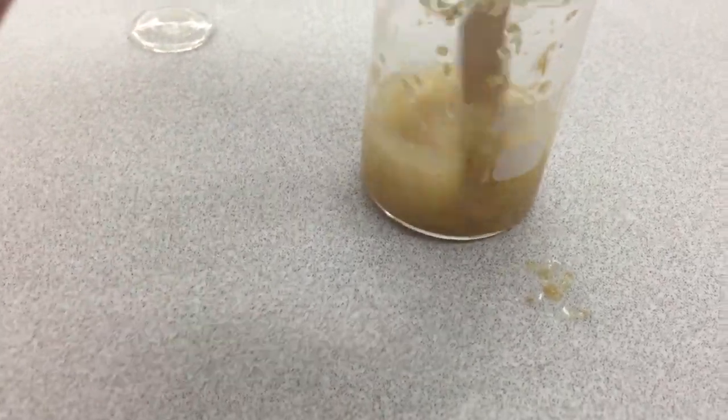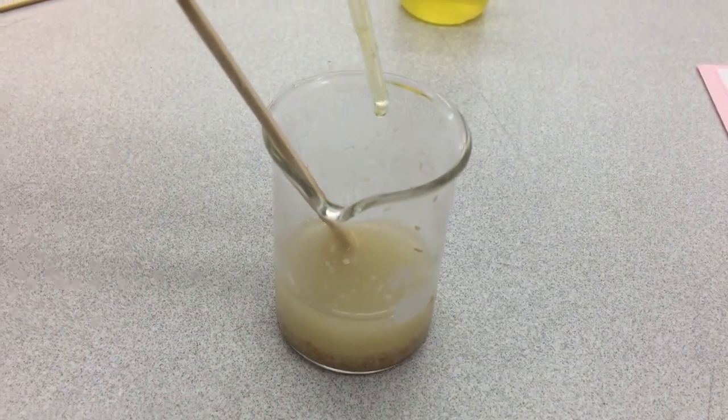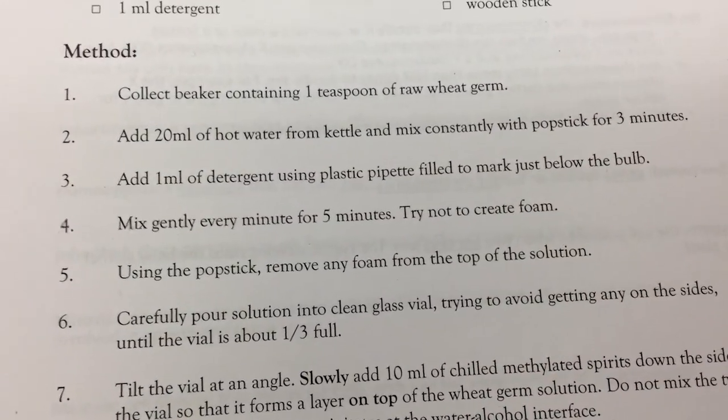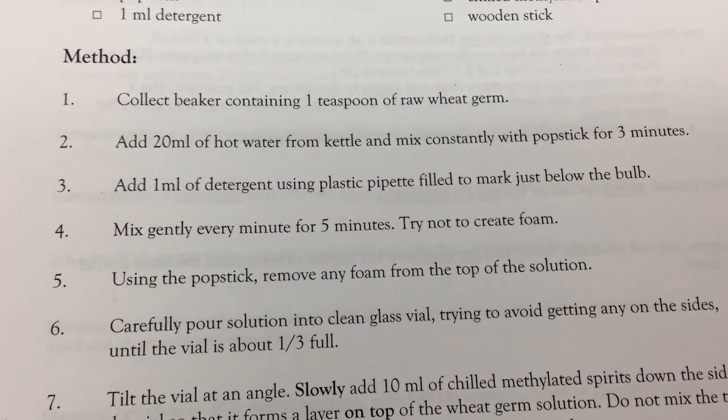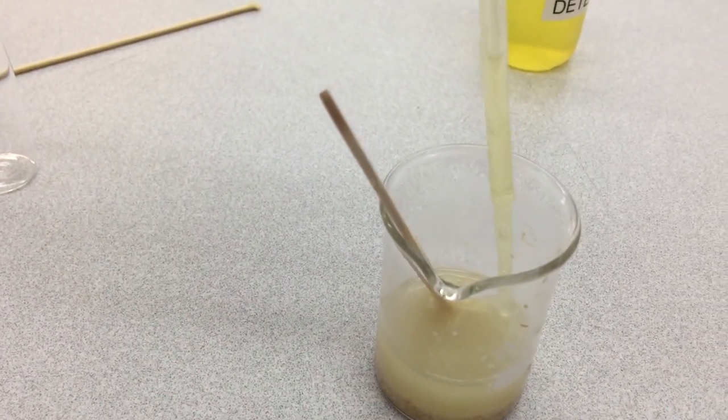I won't record for that longer. All right, we have mixed for 3 minutes, and now we are going to do step 3, add 1 milliliter of detergent using a plastic pipette, filled to just below the bowl. So we're going to add our detergent now. In it goes.